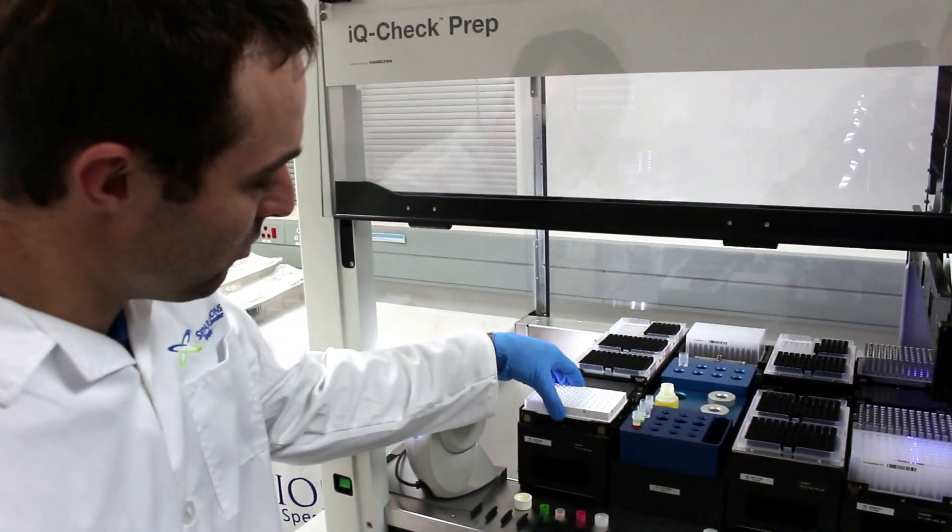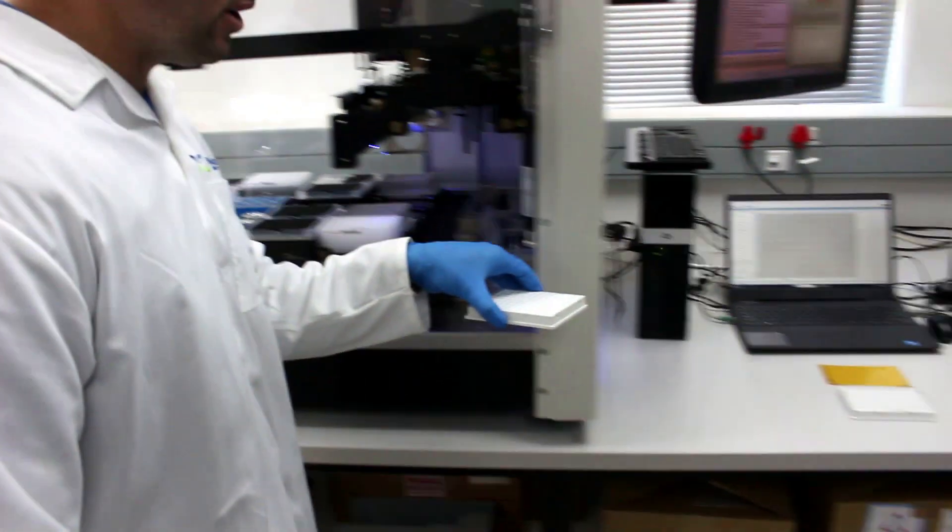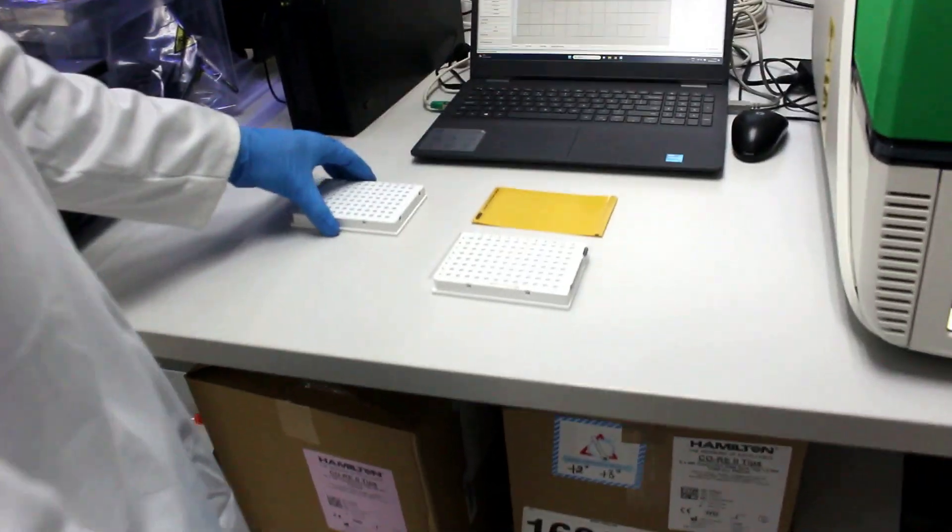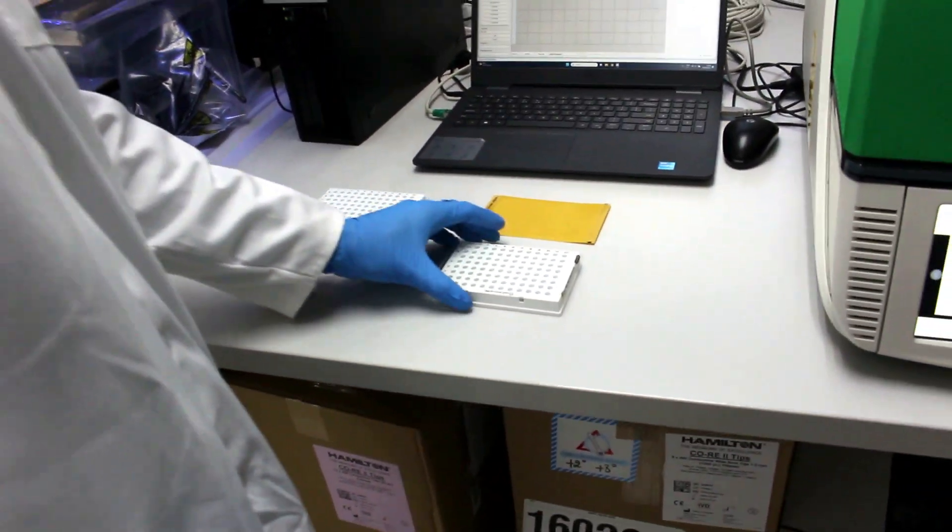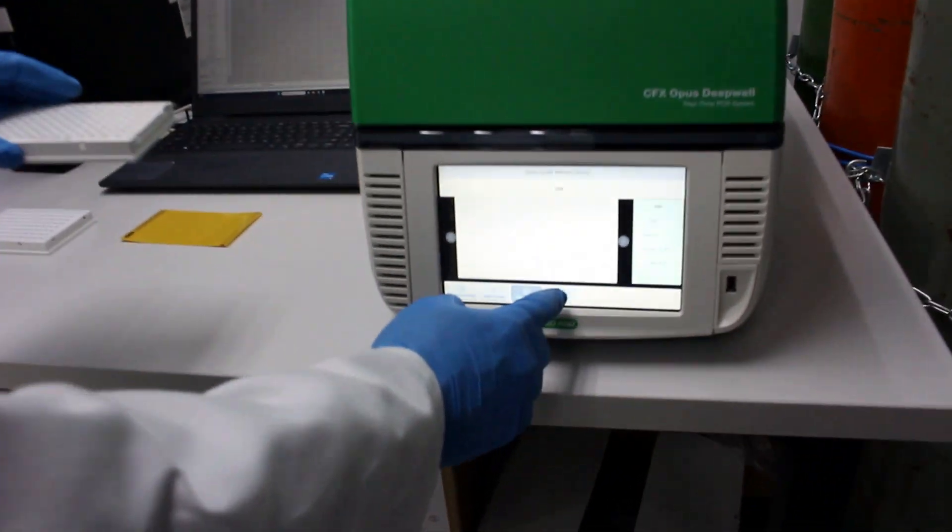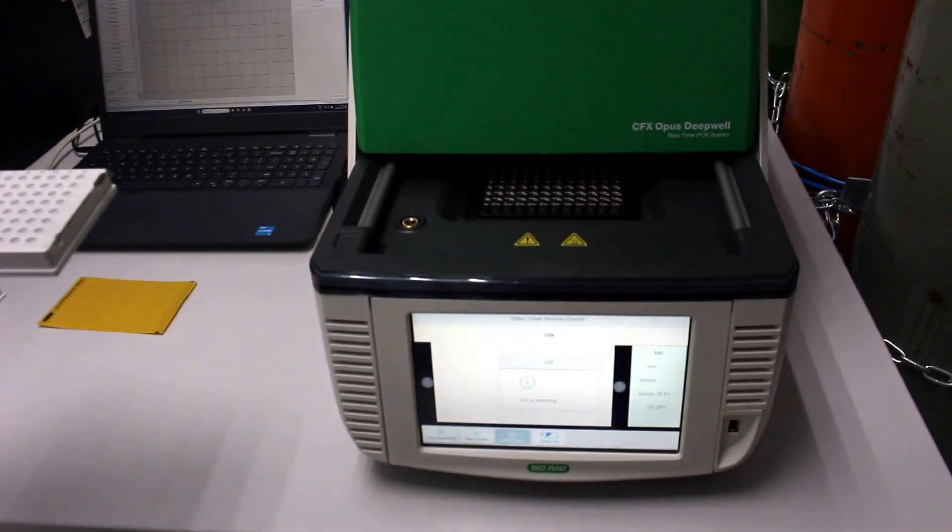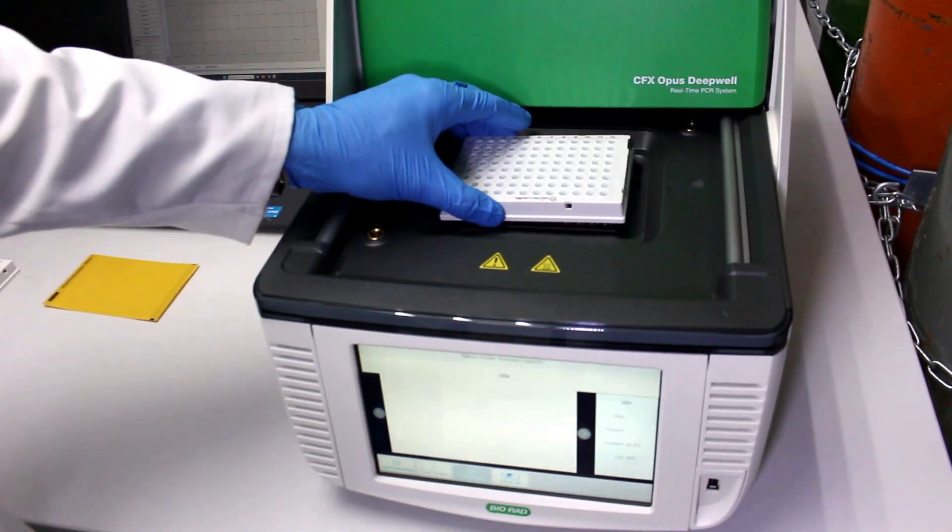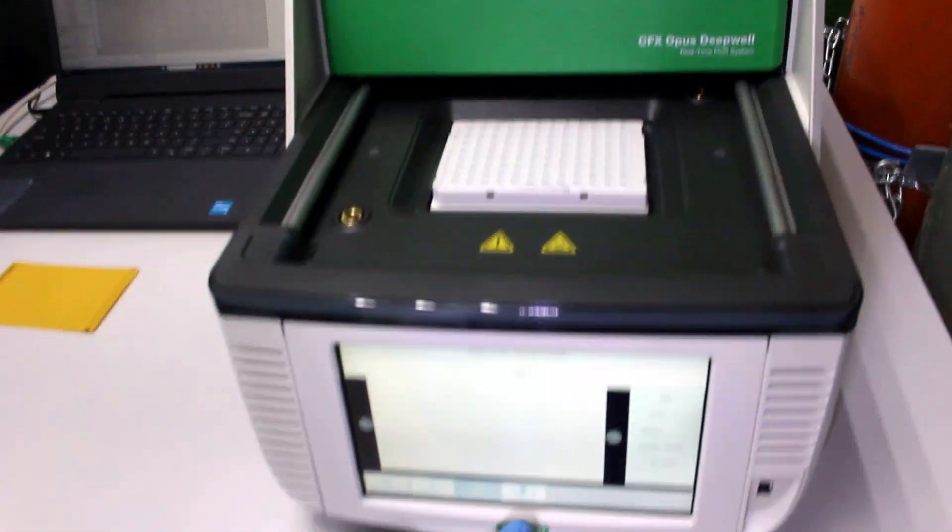The PCR plate is removed from the robot and moved over to the bench, where it is sealed with a sealing film. Once we have sealed the plate, the lid of the CFX Opus is opened. The PCR plate is placed into the Opus, and then we close the lid.